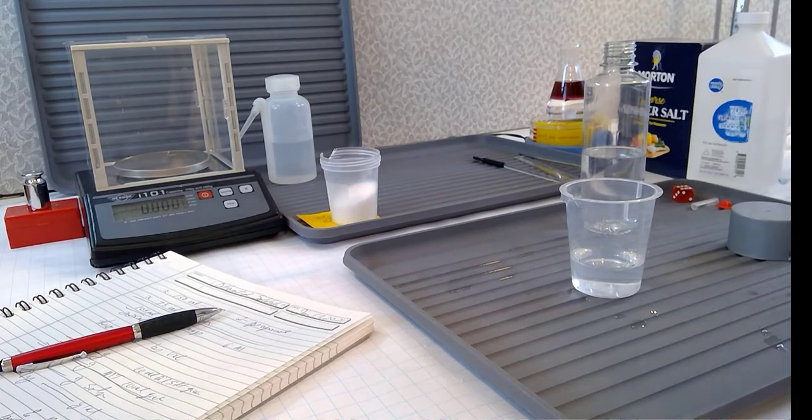I'm going to hold it up to my eye level. One more drop. Nope, too much. Still too much. Drop, drop, drop, drop, drop. Drip, drip. Because you can be accurate to about a drop or so.